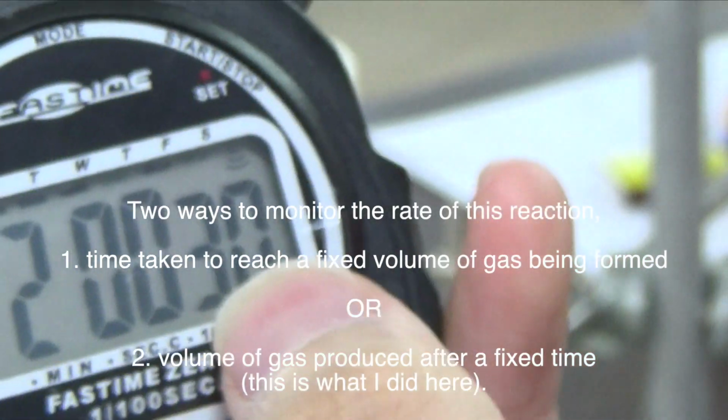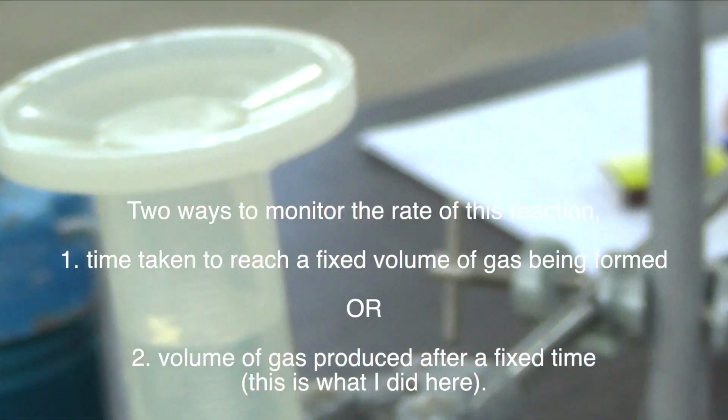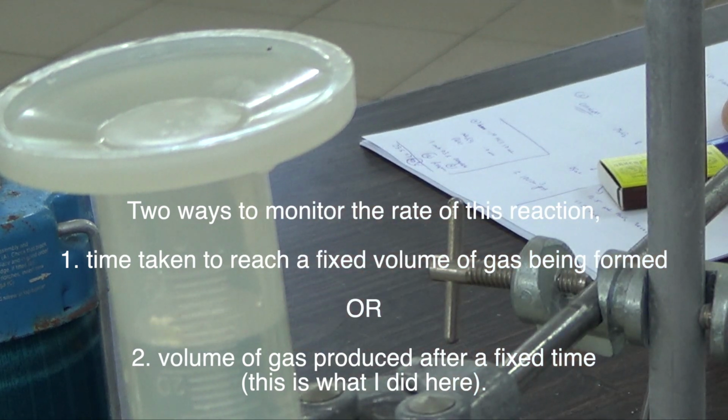The thing at the very end there is just a very accurate seconds reading, but you read to the nearest second, which is 0. So 2 minutes, 0 seconds. There's 2 minutes times 60, there's 120 seconds, and you produce 18 cm cube of carbon dioxide gas.